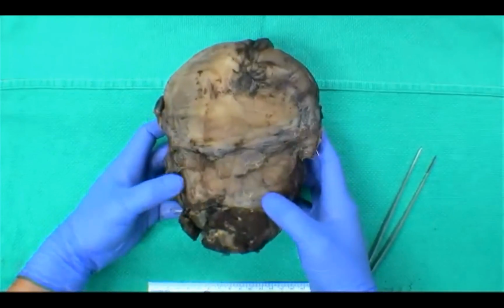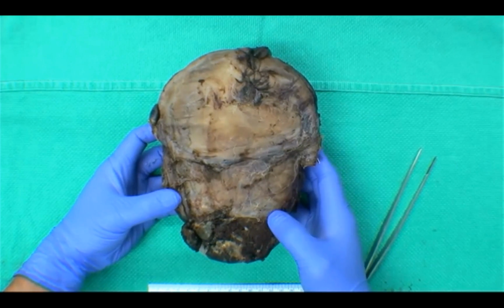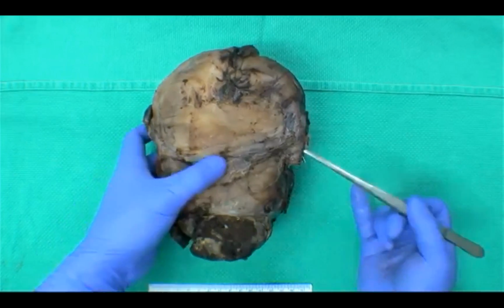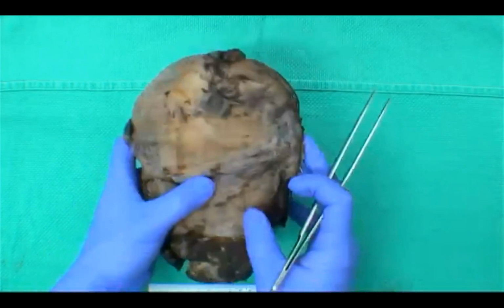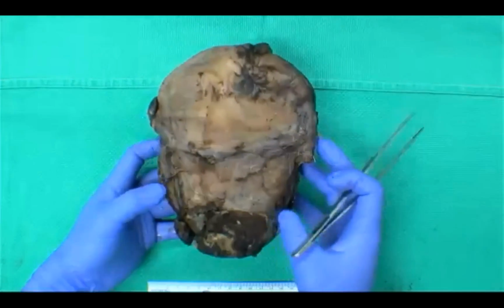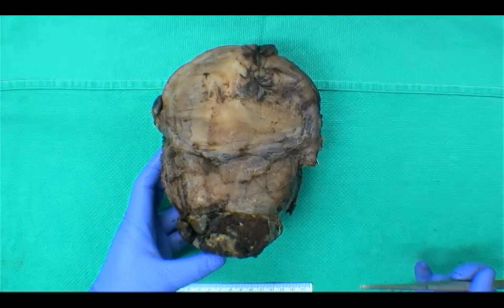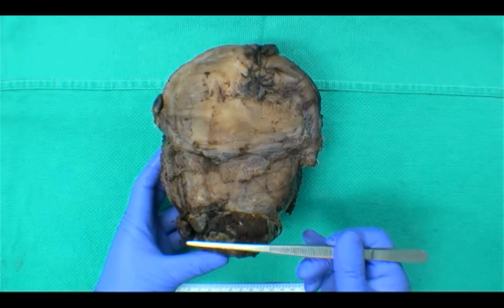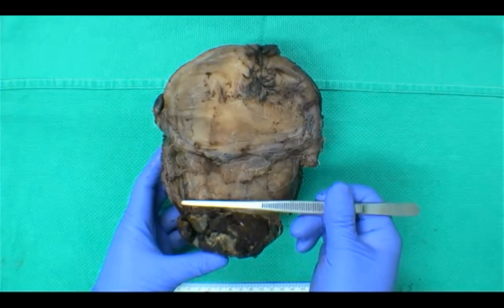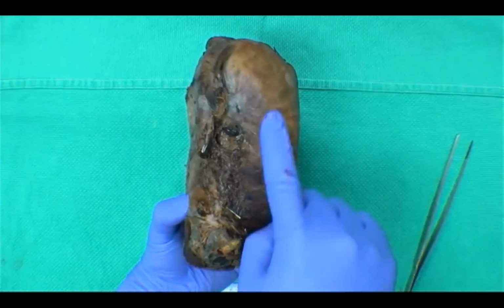But because you have a placenta that's in situ, one of the recommendations is that you don't open the uterus as per usual. One of the important things is that you want to preserve the serosal aspect of the uterus as much as you can, so that you can properly assess the relationship between the placenta and the uterus. One of the recommendations I would ask people to do is to do concentric cross sections transversely, from the lower uterine segment all the way up, and to keep the rings intact as you move up.